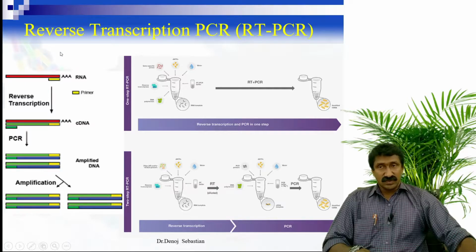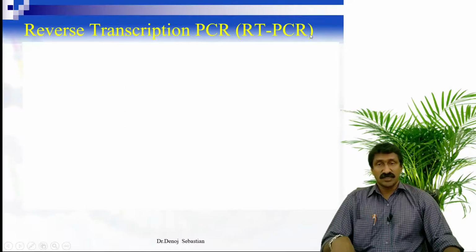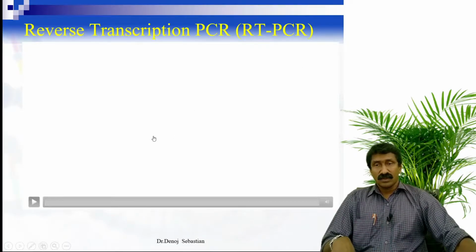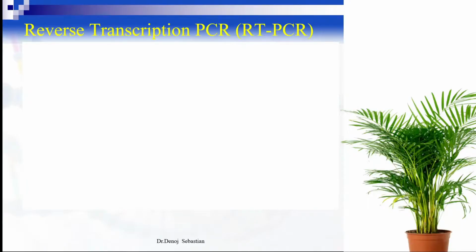So you can do this reverse transcription PCR in a single step with all the reactants mixed together, or you can do it in two steps, with the first reverse transcription step, and the second one being the normal PCR step. So both ways you can do the reverse transcription PCR or RT-PCR. Again, I will show you one video. You can see that one.